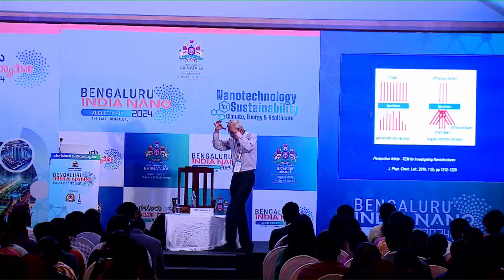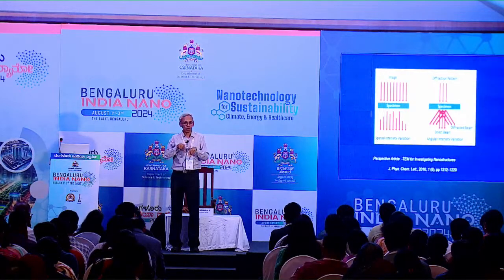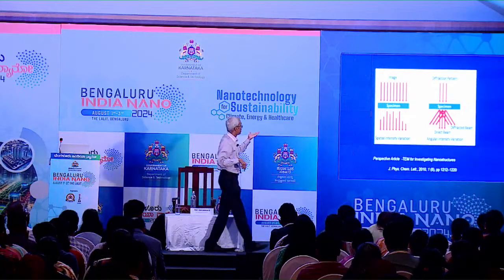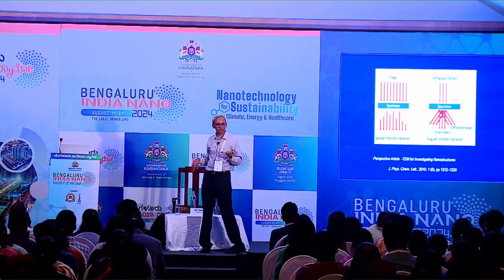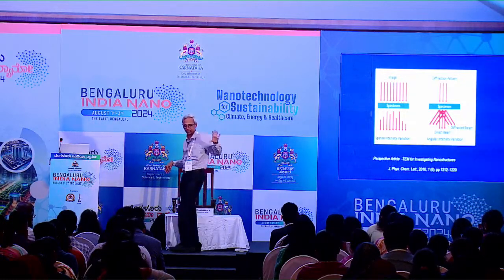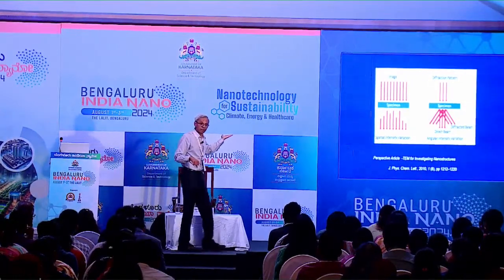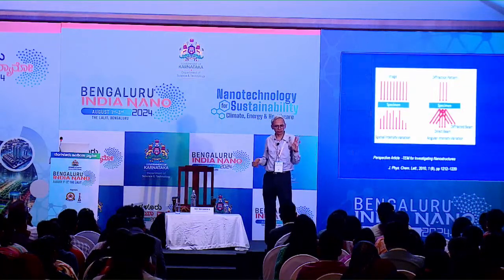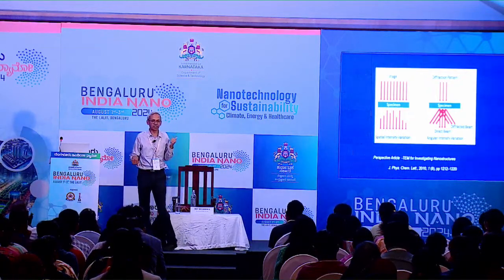Okay. A parallel beam of electrons falls on the specimen, and two things happen. Whatever is going in the same direction after passing through also goes in different directions. This is the simplest form of scattering, which is coherent forward elastic scattering. It's called diffraction, exactly similar to what happens in X-ray diffraction: 2d sin theta equals n lambda. The only difference is that d is the same because the material is the same, for example. Lambda, what can we say of lambda? I showed you lambda for X-rays, typically 1.5 angstroms, copper K alpha 1.54. For electrons, what did we see? 0.025 angstroms. Your lambda is very small.